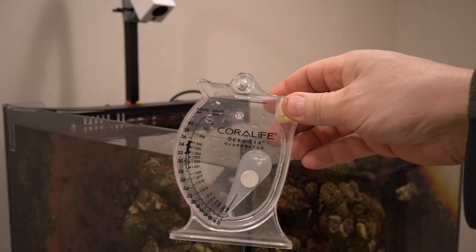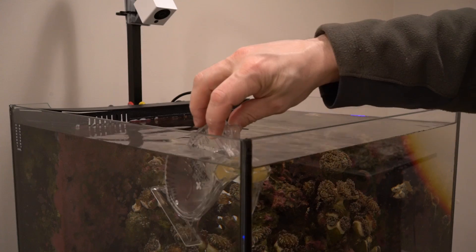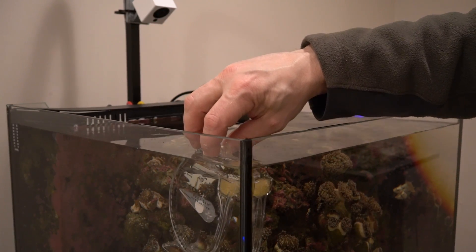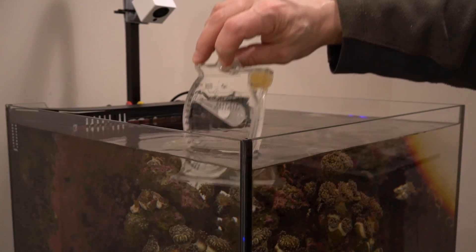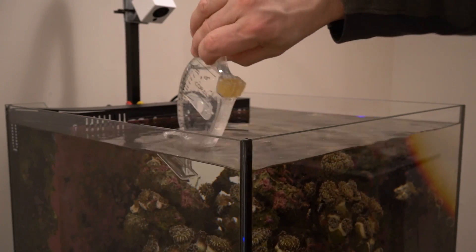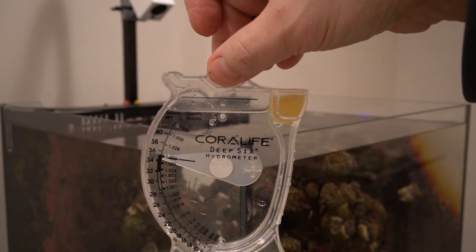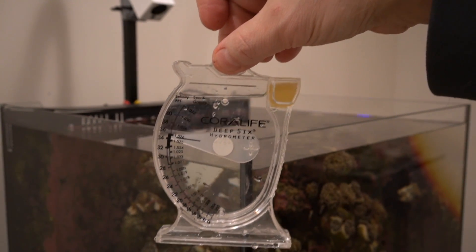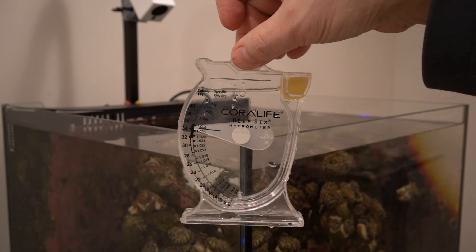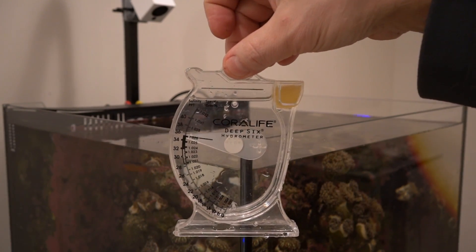So we're going to go old school. I found this in a box that I bought with an old aquarium. I used to have the Instant Ocean one. These are accurate and they're very cheap — I don't know what they cost now, this has got to be 30, 40 bucks maybe. But it works, and it's a third method — it's using density. That little white puck is a certain density, and it's basically floating on the water based on the salinity. More salinity, the higher it's going to float, moving the arm up. And look — 1.026. It's perfect.